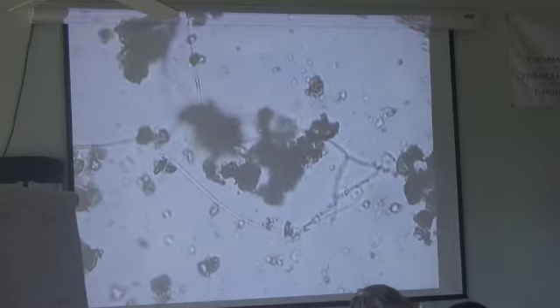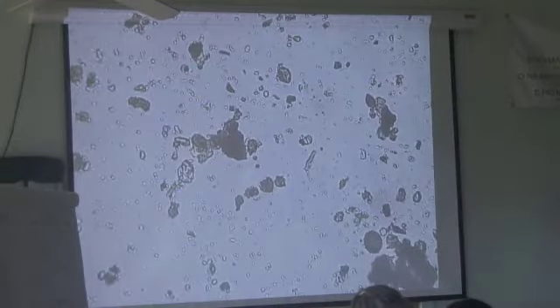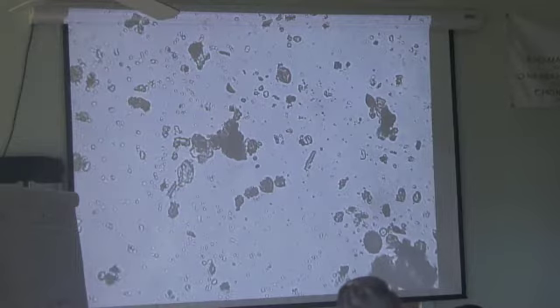Starting at the top, eyepieces, you can pull them in and out. At the end, we're going to adjust them. The head up here contains the camera port. This, where the objectives sit and rotate, is called the nose piece, and the objective lens sits on that. We have the stage with the stage holder. We have our movement mechanism, up and down, left and right. Usually it's on the right hand side. A few microscopes have it reversed, but on most microscopes it's on the right.